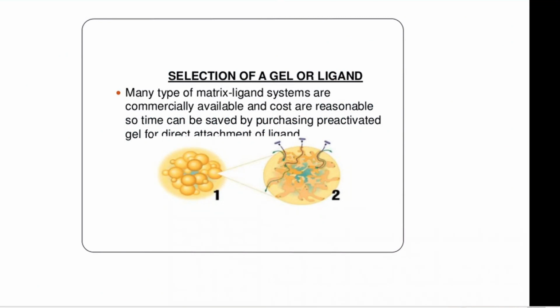And how do we select the gel or ligand? The selection of a gel or ligand purely depends on what kind of molecule you are going to separate.